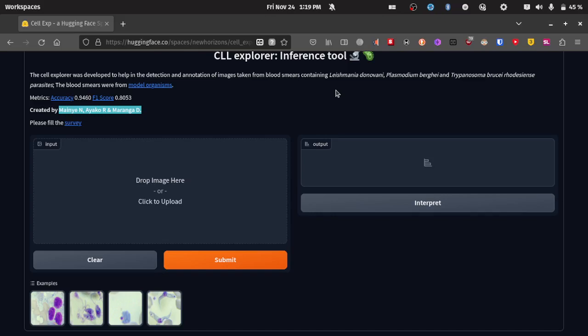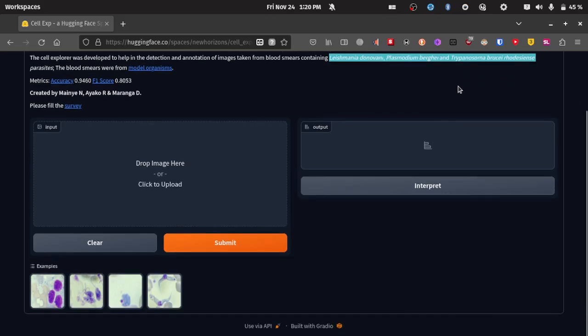So if it finds these particular pixel values within a particular image, it will associate that with a particular label, which can be these, or maybe a red blood cell, because those are the cells hovering around within this study, or something called splenocytes, which are cells found in the spleen.